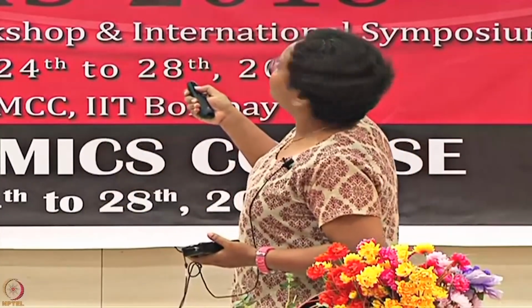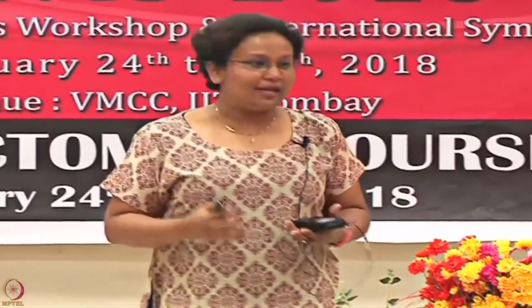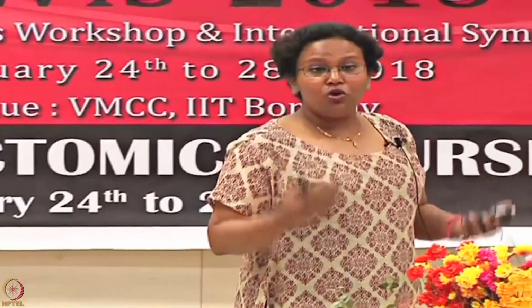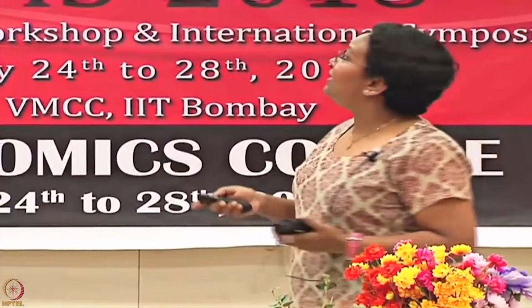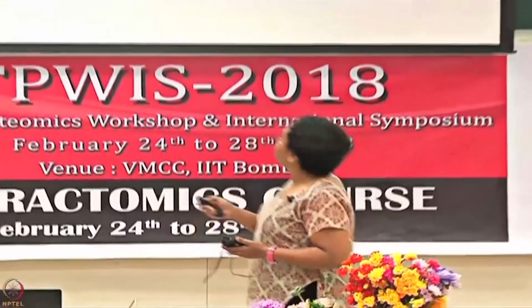You go to something like, I can't even see, 10,000 RUs, which is an extremely huge amount. You don't need that much protein. If you are reaching around 4,000 or 3,000, it's more than enough for any of the applications that we are talking about. So we did not get enough information from there. We took the same thing and ran it through the whole immobilization process.